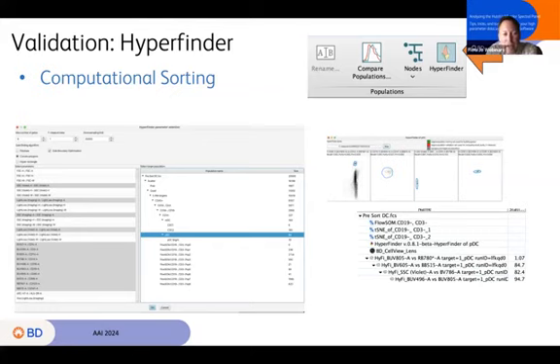Well, if you've got HyperFinder, and this was a FlowJo plugin in the past, and it is built in now, either one of those is going to work about the same. The built-in works a little better if you are specifically using the S8, and the S8 has tons of parameters, and it will look ahead of time to make sure that none of them are no-variance parameters that are difficult for HyperFinder to work with. You get a little message that says, hey, ignore this one, there was no variance. So that's a nice one to use if you're on the S8, use the built-in version.